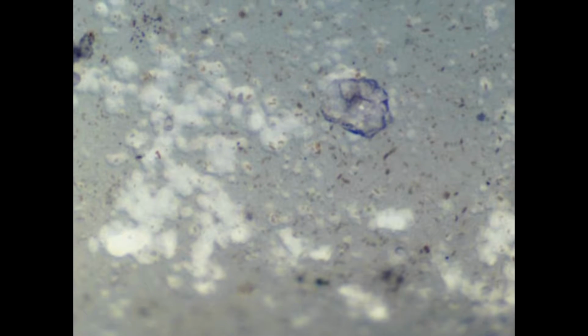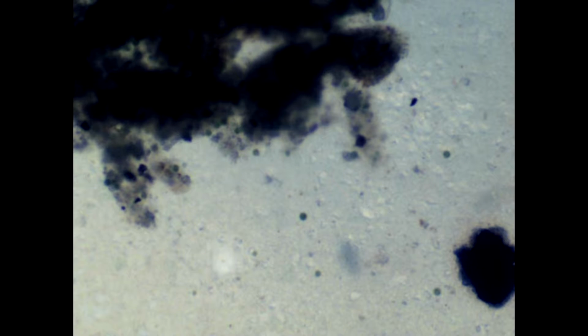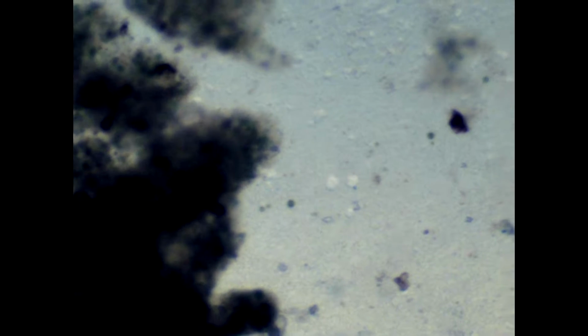So here you can see all these dots. Those are bacteria. Those look like bacillus and coccus bacteria. So there's definitely biological diversity on this piece of plastic. Not an incredible amount from what I'm seeing, but it definitely looks like there is a micro ecosystem on here. I'm just trying to find another place to look. So you can definitely see bacteria, that's for sure. But that was the fresh water.